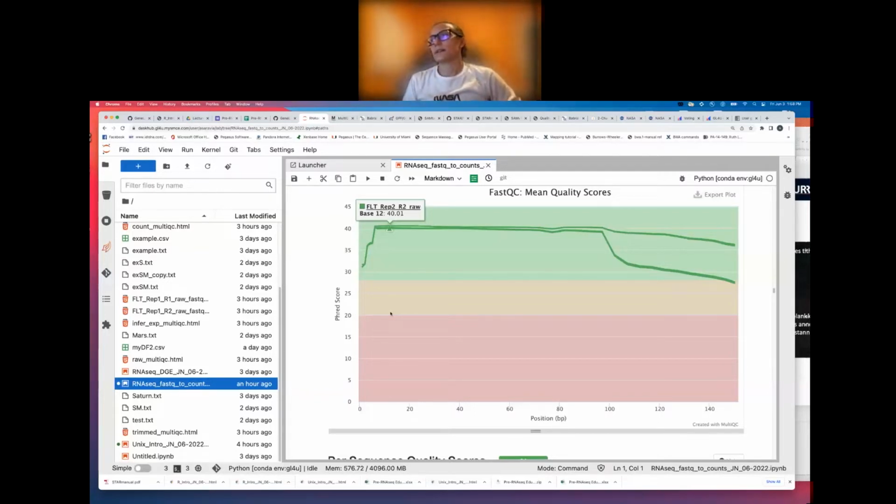Because aligners can look at parts of reads to align, some people argue that that's a reason not to trim. I disagree with those people, Susie. I think that we should always remove anything that we added artificially. But you will get some folks saying that aligners are really smart nowadays and we can get away with it.